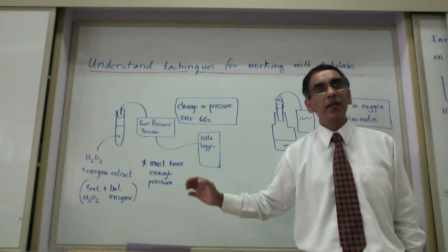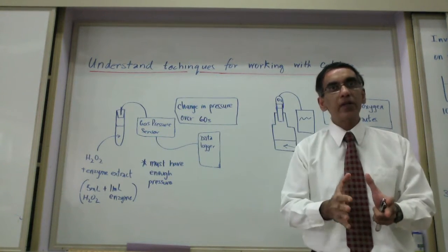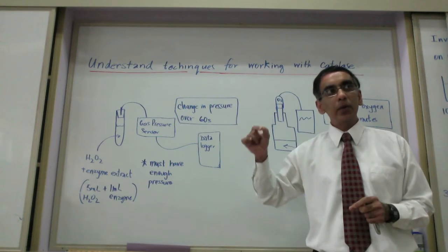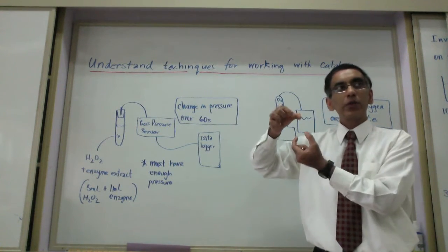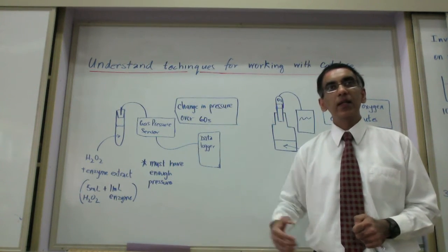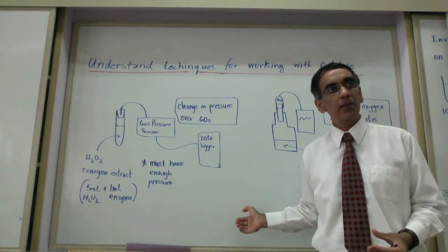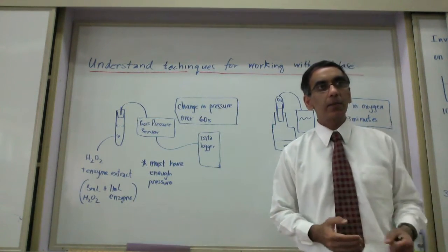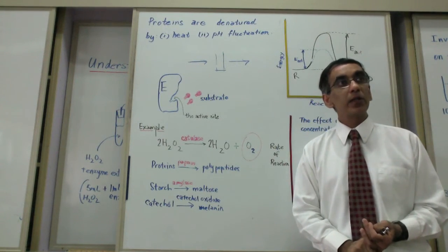But what we will have is a change of a solution's color from transparent to dark. And then we have another device which can measure the amount of light that goes through the solution: a spectrophotometer. We will learn how to use that at the next class. And then you will have the choice whether you want to work with some area with this enzyme or something concerning that enzyme. So you can think about changing the enzyme concentration, which is what we're doing today.